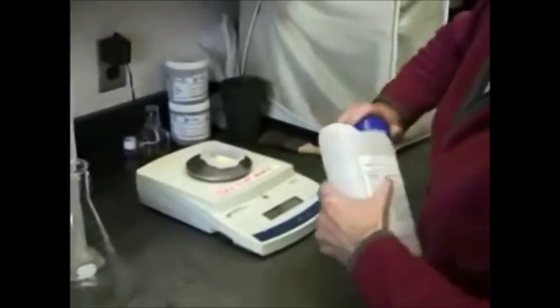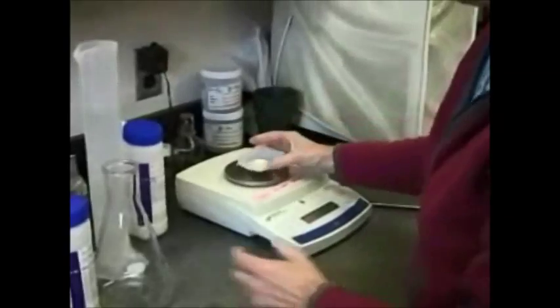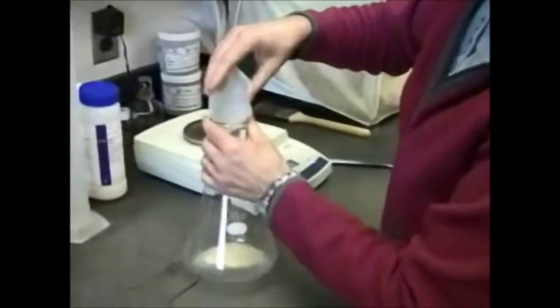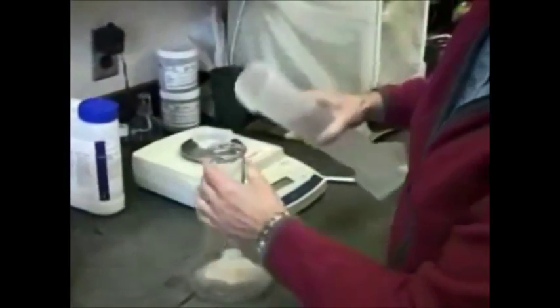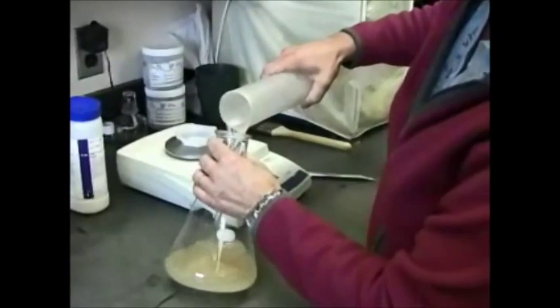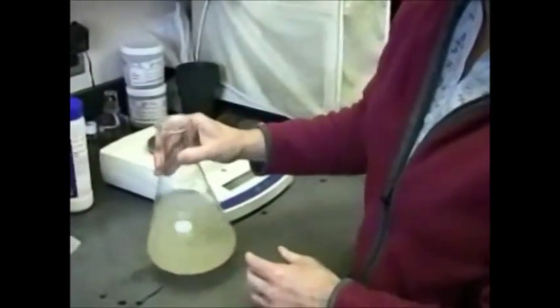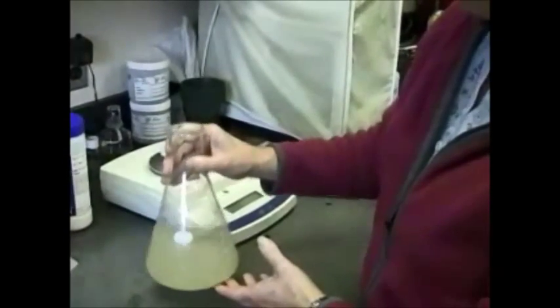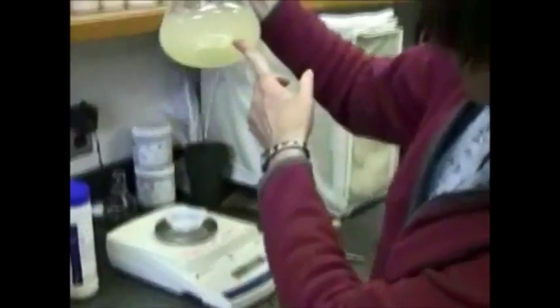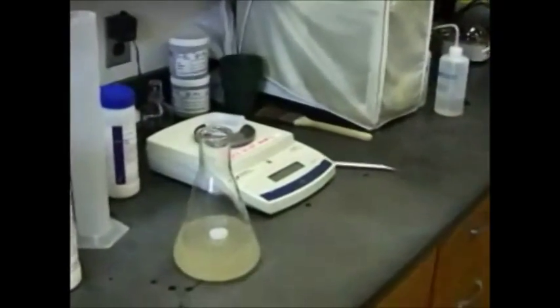Now she's going to combine that with water here in a one liter Erlenmeyer flask and add her water. Notice when you're making agar you only fill the flask about half full, and you're really careful when you swirl it so that you don't get the agar powder up on the side of the flask. Just want to get it distributed evenly in there. Then Calla's going to top off the flask with some aluminum foil.